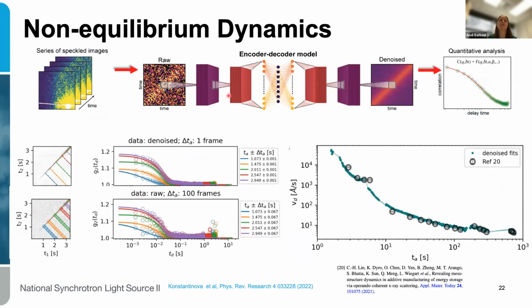So in terms of non-equilibrium dynamics, you can see it's much simpler to bin. We actually get single line cuts, with more or less the same fitting error after these two times have been denoised. These are raw. And then the result would look something like this. So this already looks really promising in terms of understanding more about your samples and using every ounce of the data without having to spend more time collecting data.